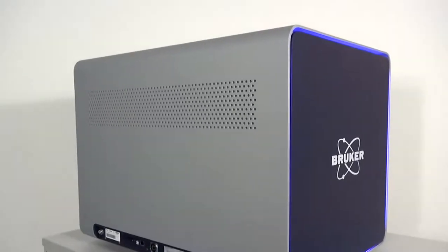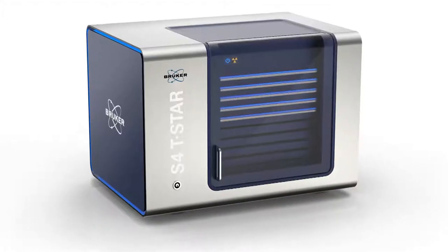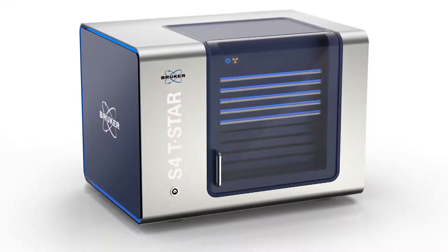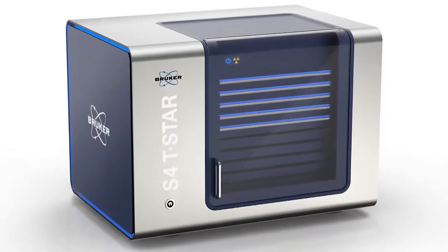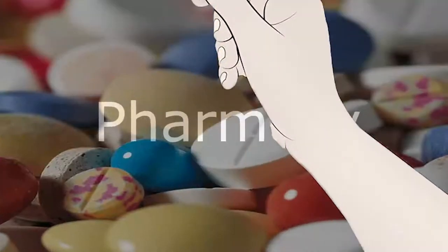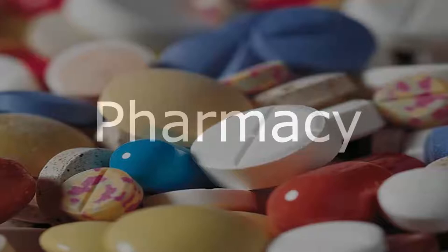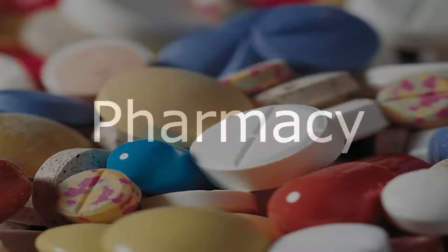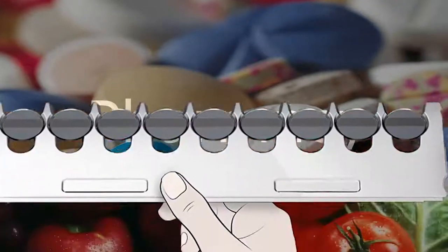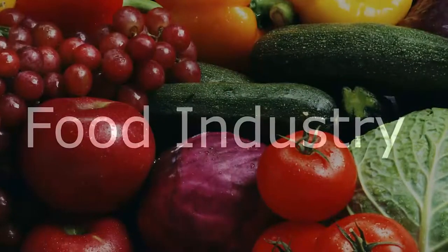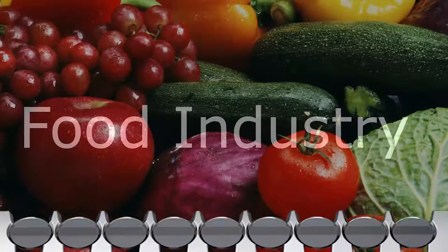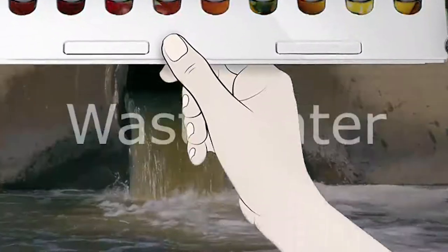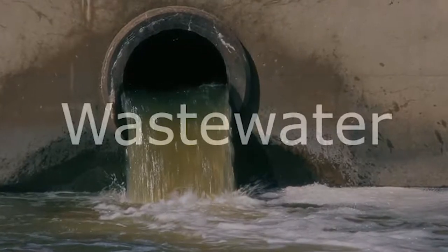The S4 TSTAR was specifically designed to meet the growing demand in increasingly regulated areas, such as pharmaceutical production according to the new EU and US pharmacopoeia standards, new product development and quality control in the food industry, or control of contaminants in wastewater slurries and effluents.